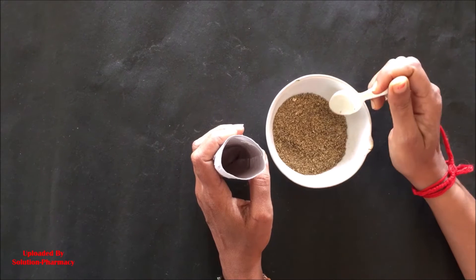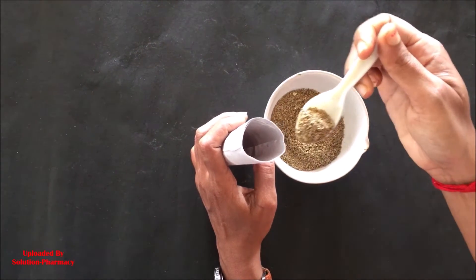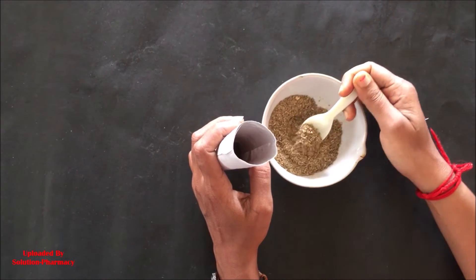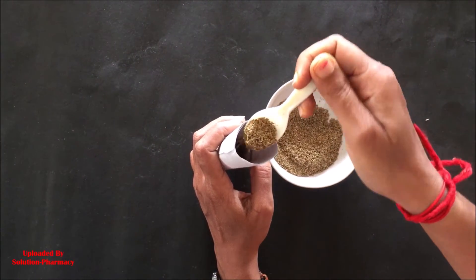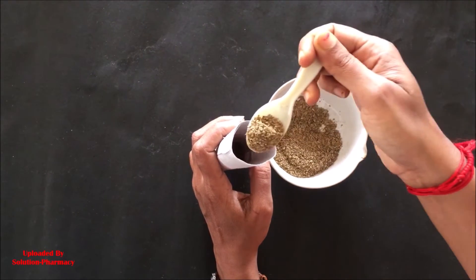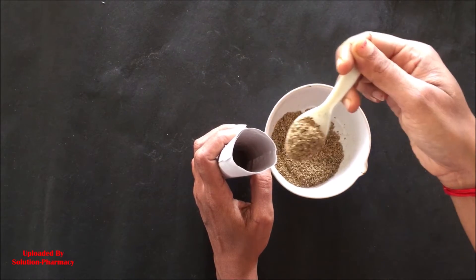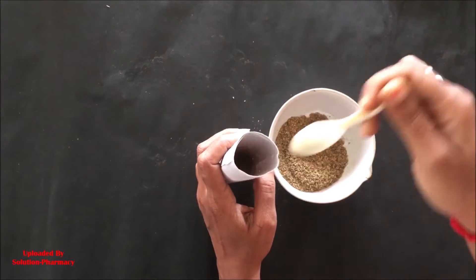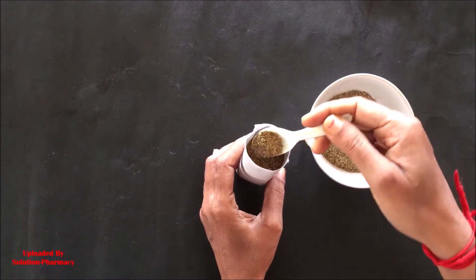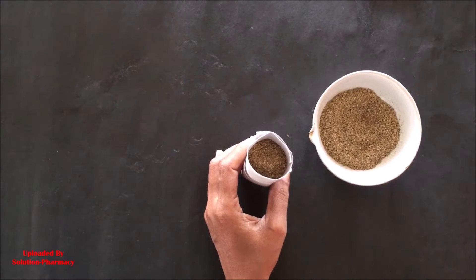Now we introduce the powder drug material to be extracted. Take the specified amount of powder drug material as specified in the procedure, then transfer this powder material inside the thimble with the help of a spatula. The powder we are using is coarsely powdered. Note that the powder should not be very fine, otherwise it will form a hard cake during extraction and the solvent will not be able to percolate inside the extraction chamber, disturbing the extraction process.